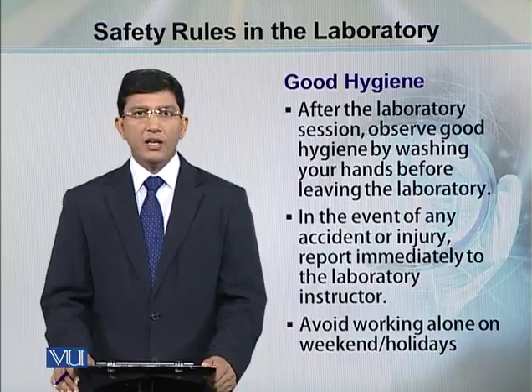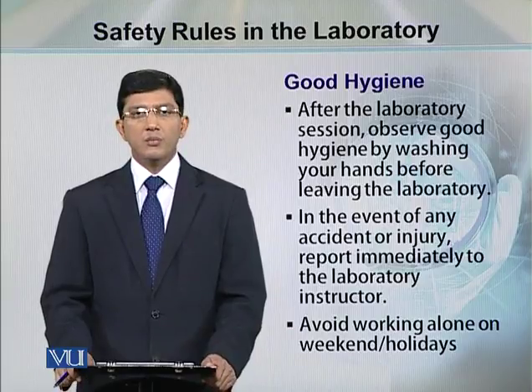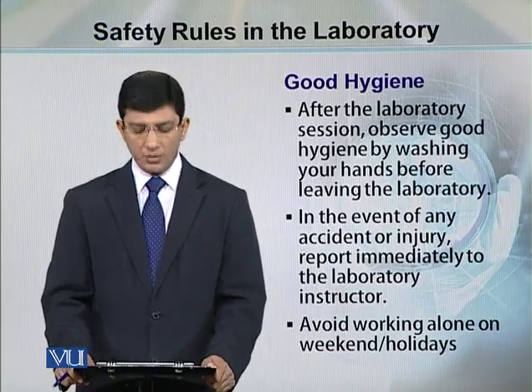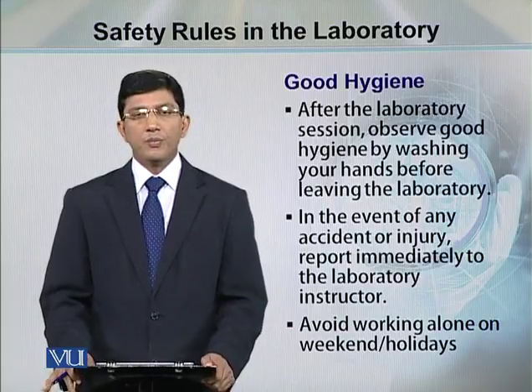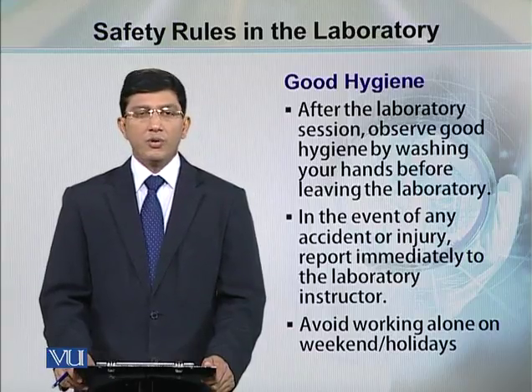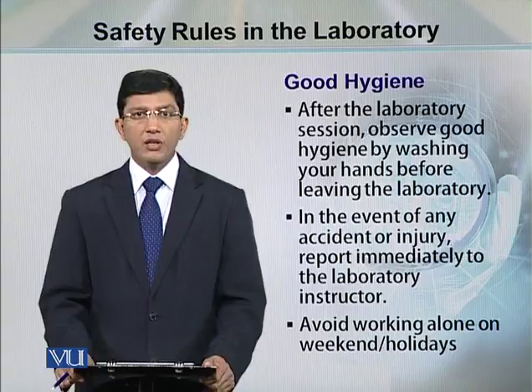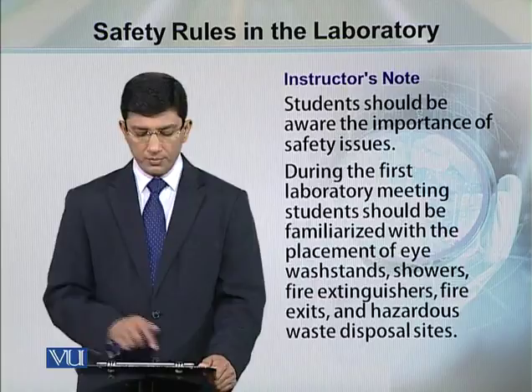In the event of any accident, don't avoid the situation. Try to inform the laboratory supervisor or laboratory instructor, so that proper management of the accident can be done. Avoid working alone in the lab on holidays or weekends, because in case of any accident, nobody will be there to help you, and that is not good for your safety.